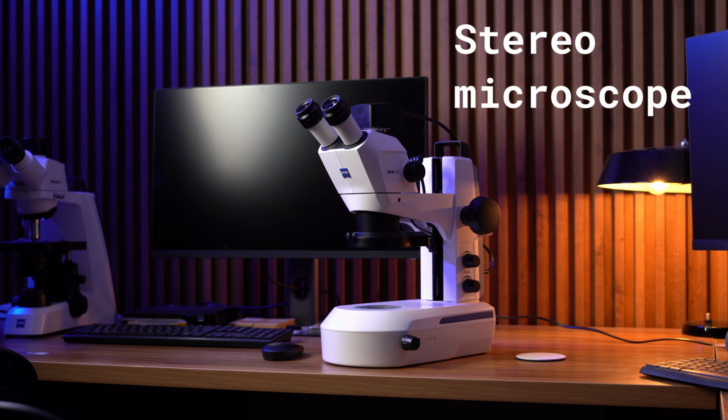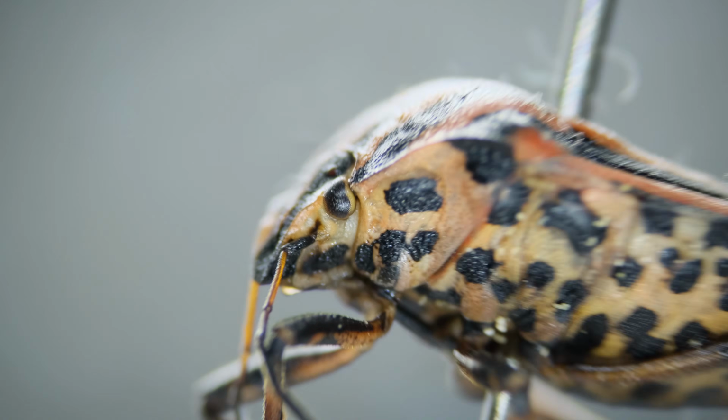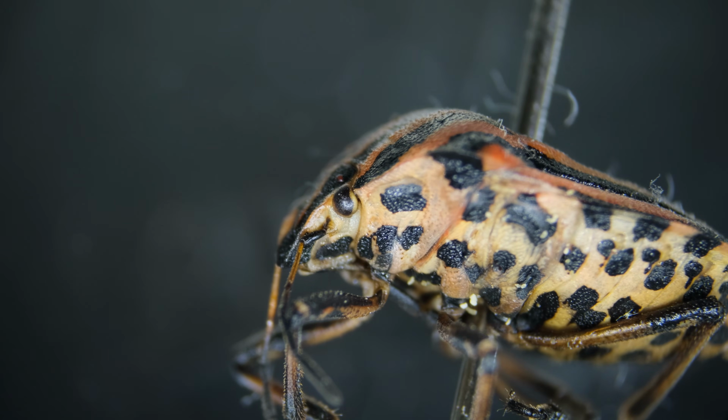Stereo microscope. A stereo microscope is a great option. Maximum magnification will be around 50 times. Yes, technically you can add auxiliary optics and eyepieces and push it close to 200 times, but keep in mind the real resolution won't increase much. In this price range, fair enough, 50 times is what you get.